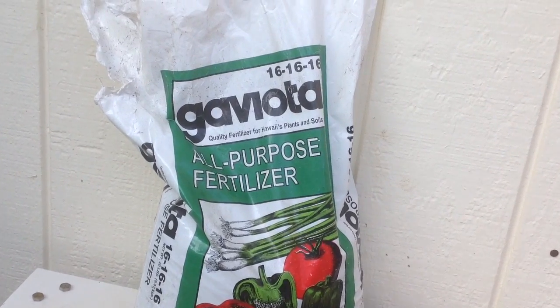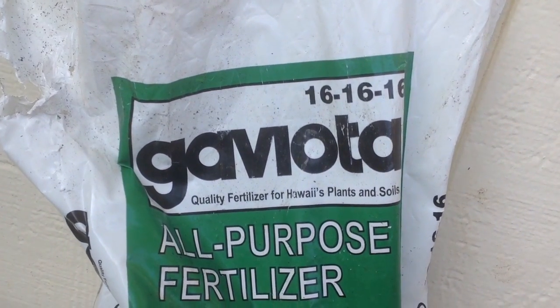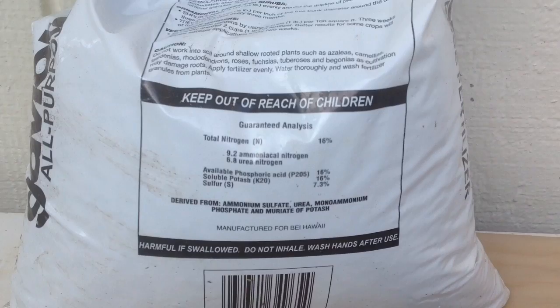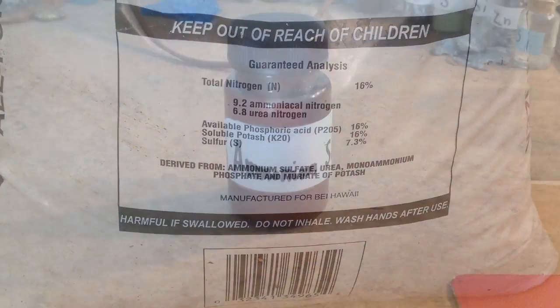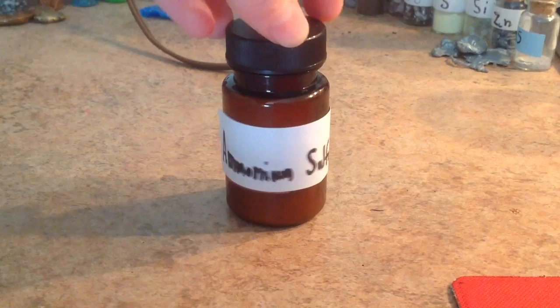Hey everyone, so in this video we're going to be turning Gaviota fertilizer, which contains ammonium sulfate, into the pure crystalline form of ammonium sulfate.